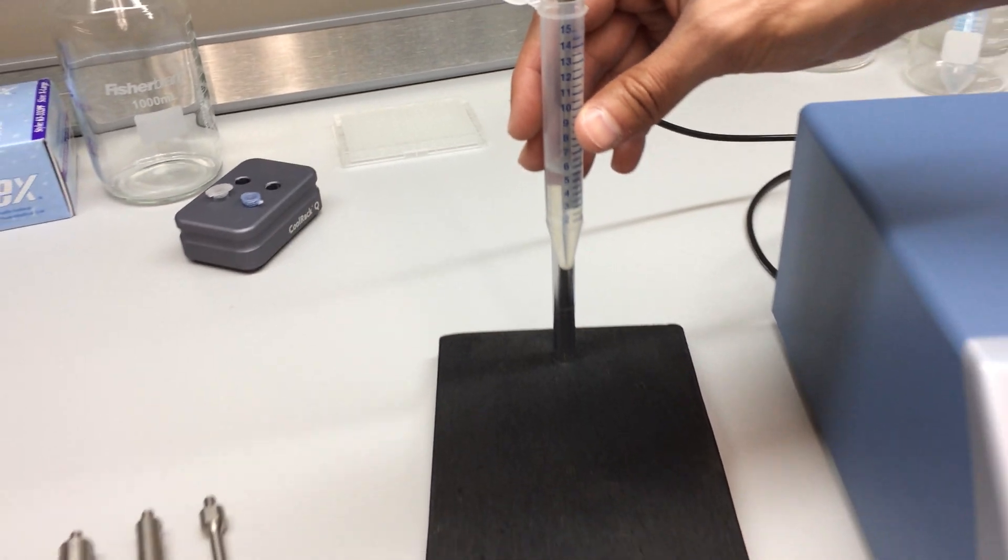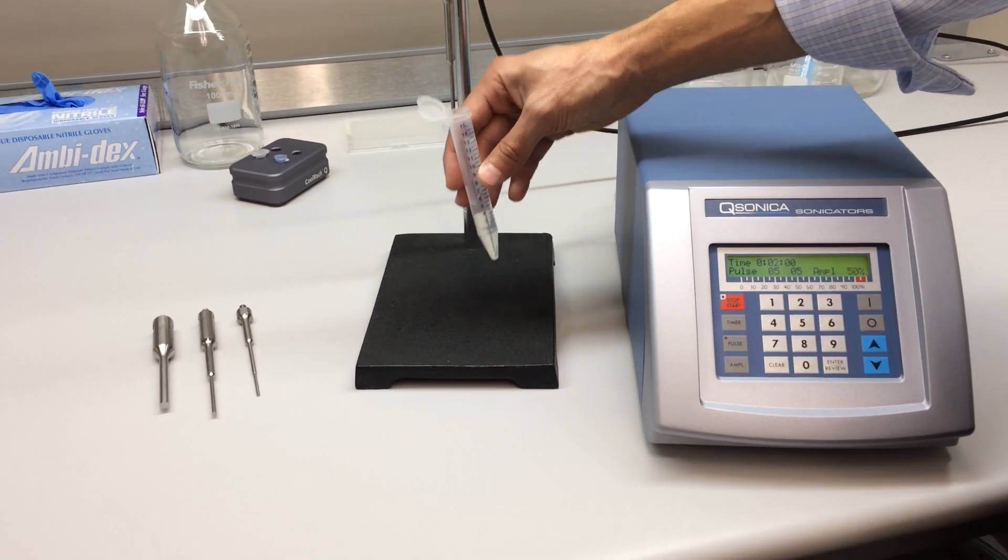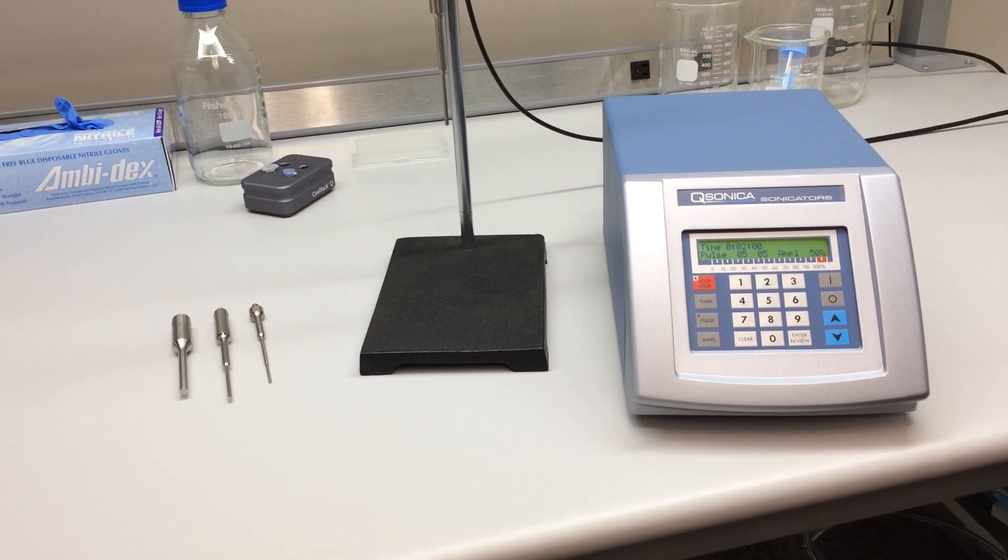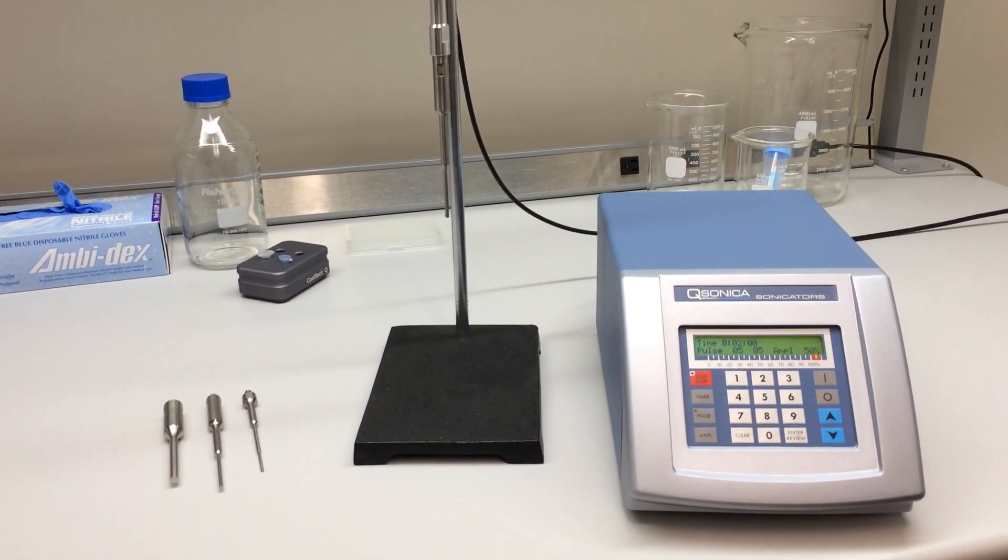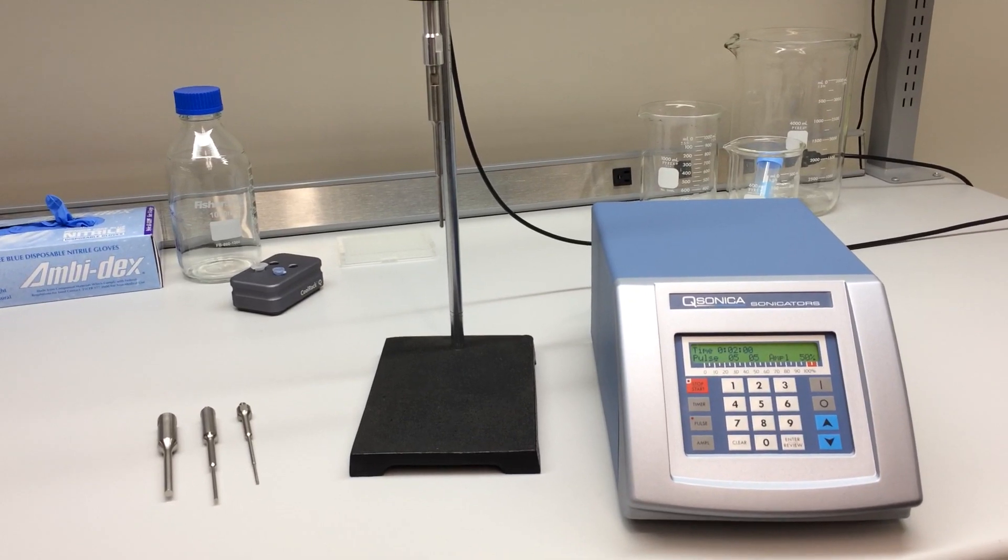The Q125 is ideal for small sample volumes and for users that do not plan to scale up to larger volumes in the future. This model offers the same programming and display features as the larger Q500 unit.